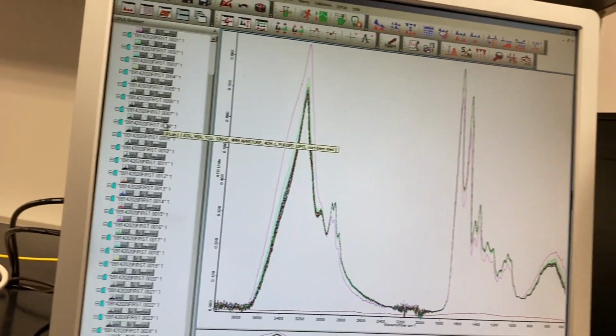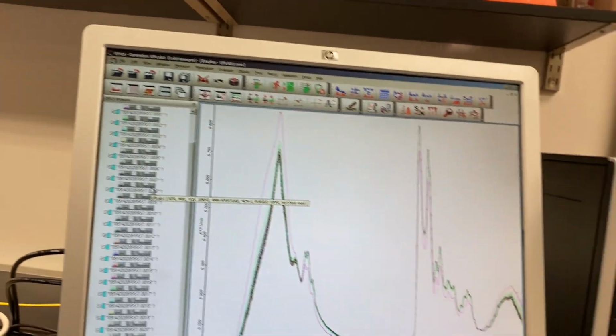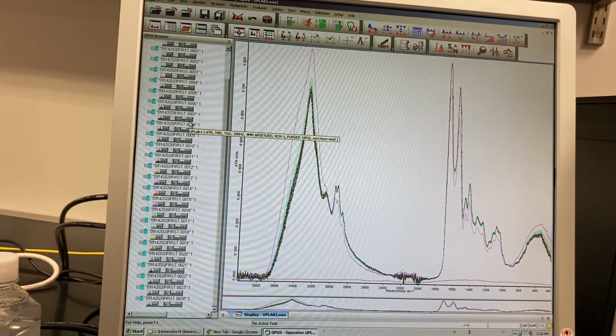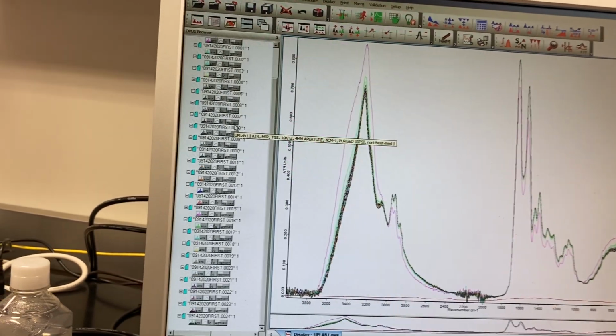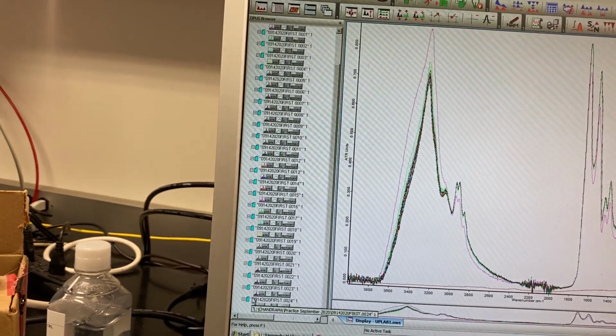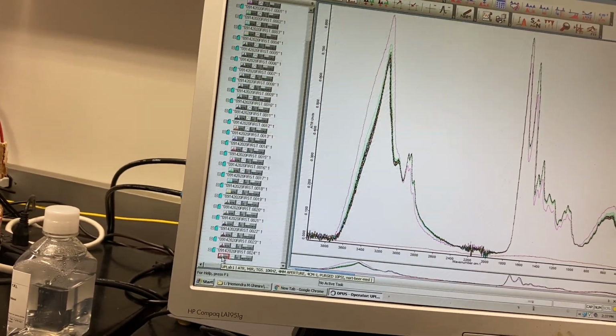Studies show that after 8 or 10 minutes you can get reproducible measurements of serum. But today I am not using a fresh sample, it was a waste sample, and I didn't put it in the freezer for a long time, so it may have taken different times. So to avoid any confusion, I just select up to spectrum 24.